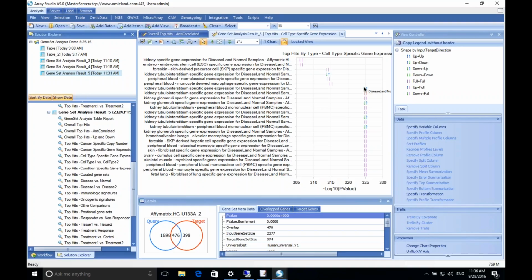This is all available today. I would probably talk to your administrator or talk to us about updating your server because it's an area that we're developing on a regular basis. So you at least want to be up to date, I would say at least from the last couple days.